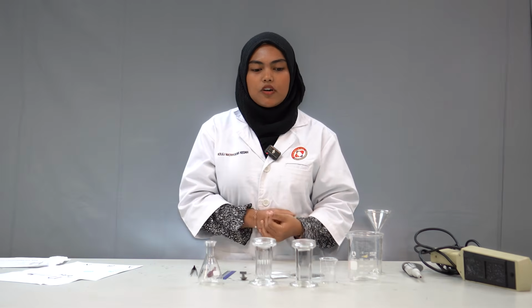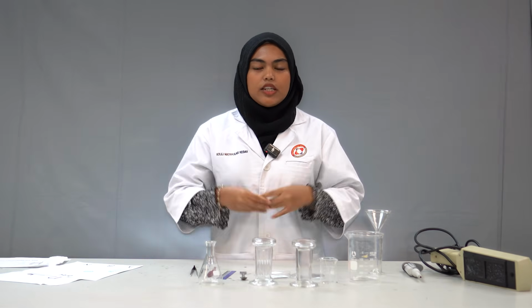In clinical settings, it is basically used for detecting the presence of drugs of abuse, and in pharmaceutical, it is widely used for production and quality control.